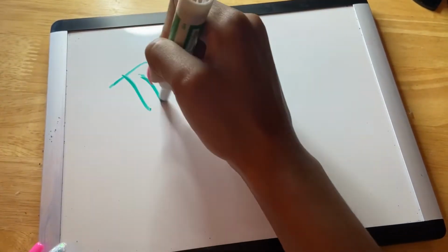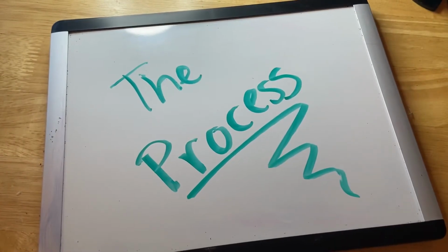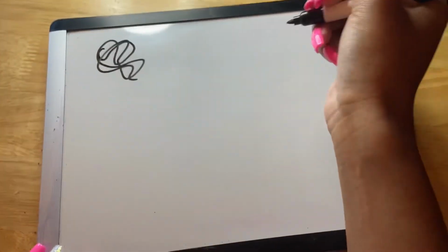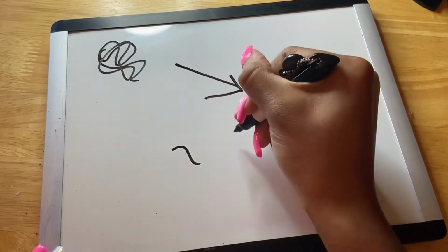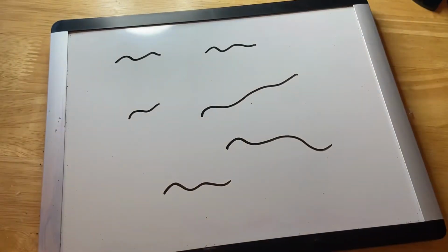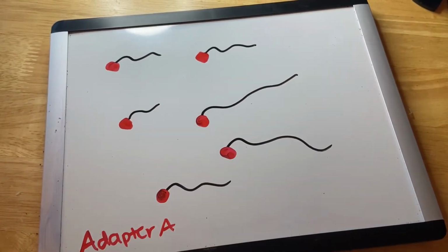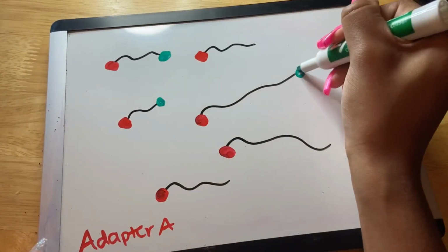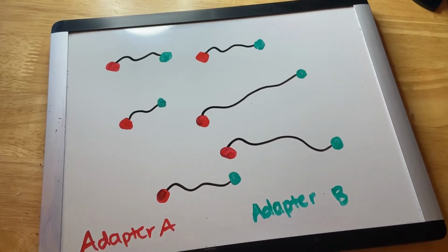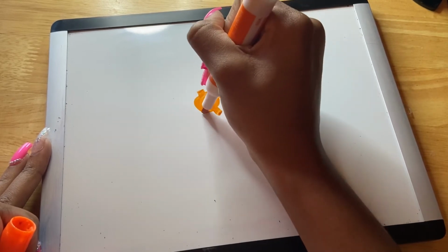So next we can get into the meat of this, how the process is carried out. Firstly, a DNA fragment is chosen and then it's cut into shorter random fragments by physical shearing. So then after you get your randomly sized fragments, you would add adapters to them. There's two adapters in this process, usually called adapter A and adapter B. Once the adapters are added to the DNA, you can now put them on your capture bead.